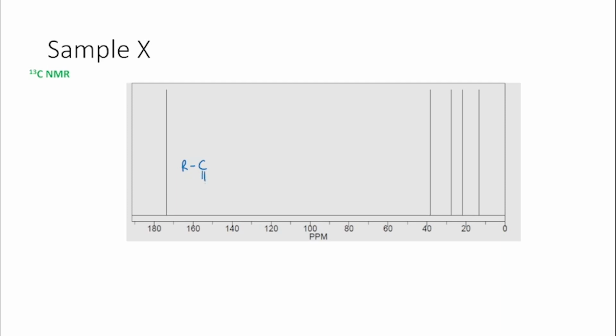When we did the acid test, we didn't see a signal. But we are in this region of esters and acids, and we're not in the region of aldehydes or ketones. So we probably don't have a ketone and an amine. We probably could work on the assumption that we may have an amide, to make it a little bit more targeted in our next steps. Don't discount having a ketone and an amine, but our NMR spectrum signal is suggesting this isn't the case.